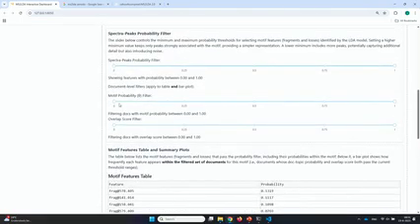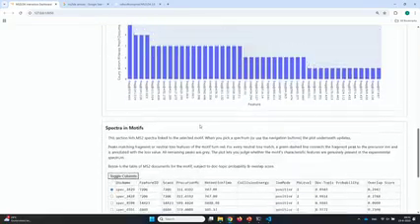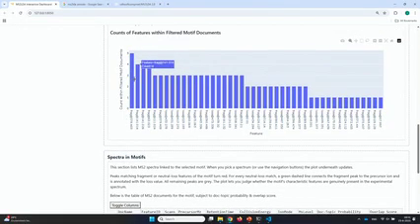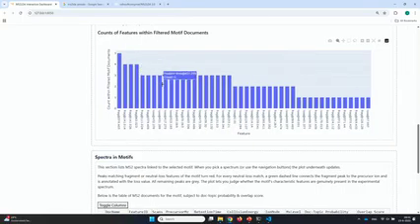And we can also play around a little bit with the probability score, for example. Let's come a little bit higher. And then you will see, okay, that changed a bit, right? So you have now 141, obviously present in less ones, so in 4. And the 158 is gone. Should also be somewhere. I can't see it now.